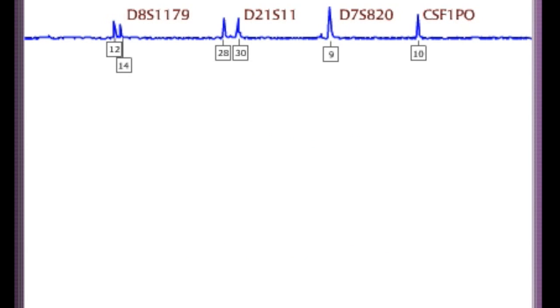Let's look at the blue channel for this person, which shows the result for 4 STRs. Each peak is an allele. Each locus occurs as a pair of peaks if heterozygous, or a single peak if homozygous.